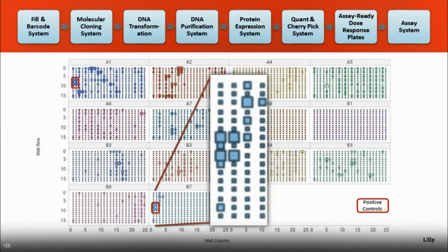So for the data coming off the system, we're using a DART report to aggregate the data, and have made Spotfire templates that, with minimal touch points, take that DART report and drop it right into a Spotfire template to get what I would call the 10,000-foot view of our systems. And so we're plotting row versus column and trellising by plate. So this is 2 sets of plates, A1 through 8, and then what we're calling B1 through 7. What I'm typically doing here is sizing by the OD readout.